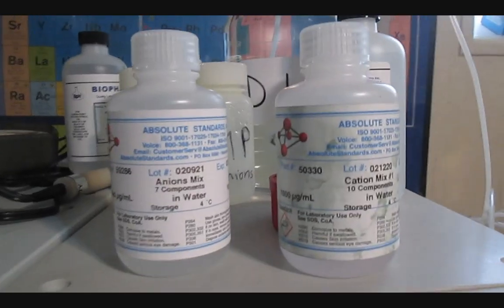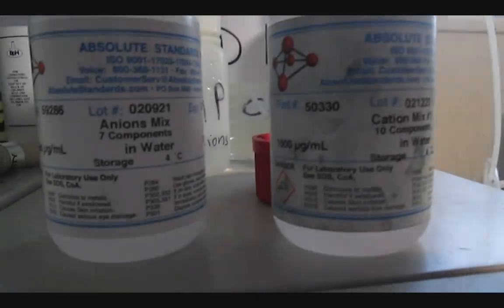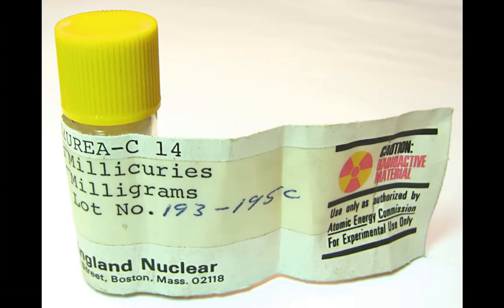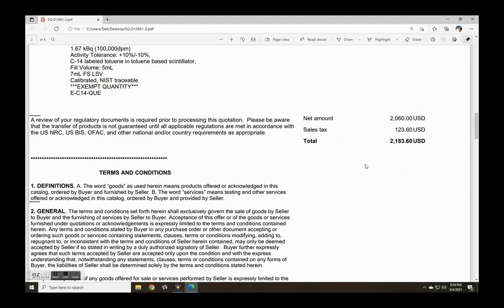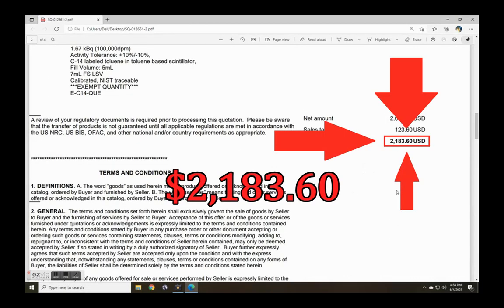Just like any analytical instrument, I needed a known standard to calibrate my method and validate my results, but the price for the unquenched standard source for carbon-14 is beyond my affordability. So I made my own.